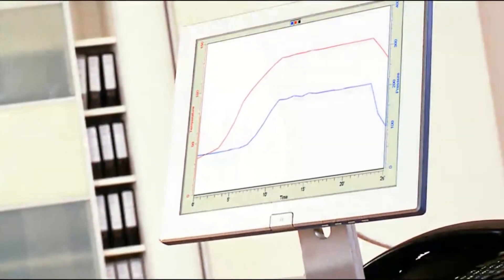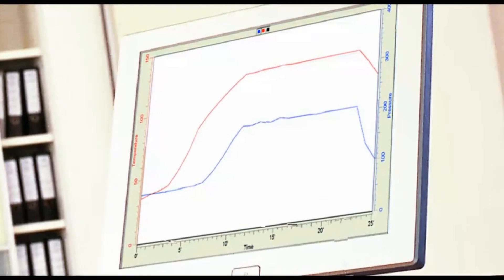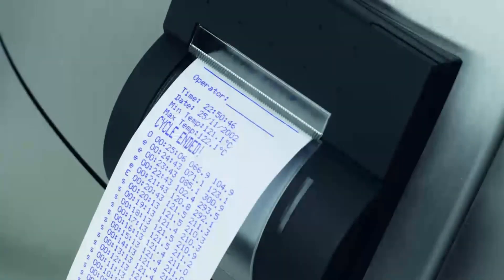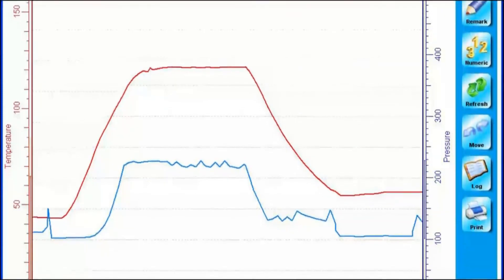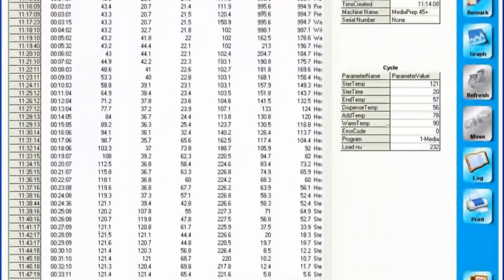For quality control and documentation purposes, cycle information can be recorded via ticket printer or via PC. Information on temperature, time, and pressure can be stored with each cycle run. This information can be displayed in either graphical or numerical formats.